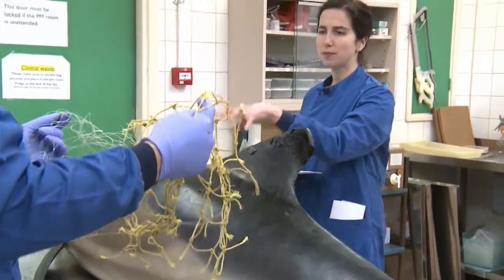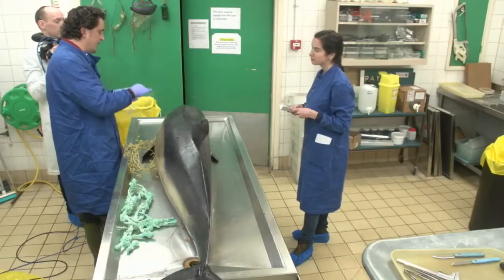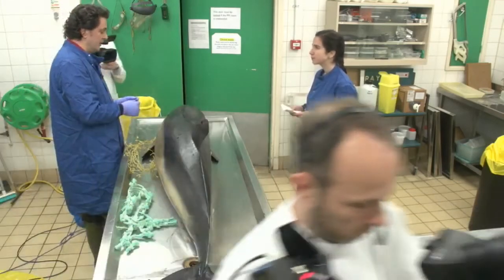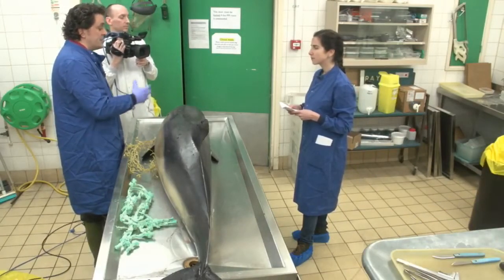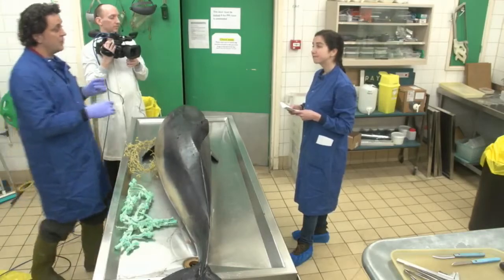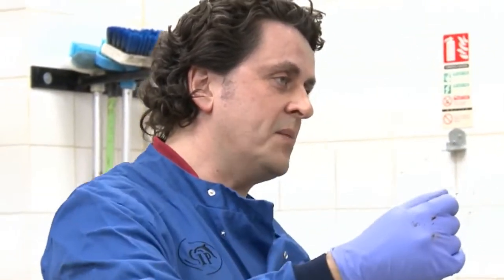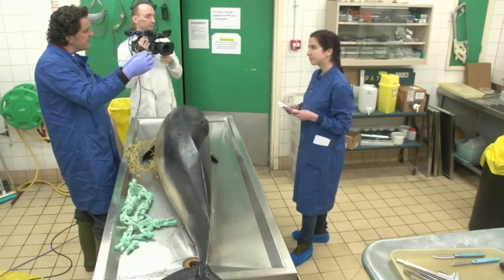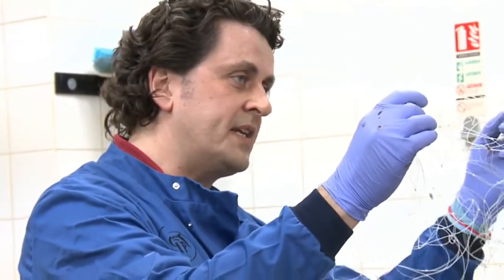So can we match up the marks on the animal then with the gear? Yeah, so that's what we're trying. Well, we can diagnose bycatch fairly readily. What we're really trying to get more involved in now is diagnosing the kind of fishery that's capturing these animals. So to generalize for a second, take a step back. Harbour porpoises, we think, are predominantly caught in monofilament type gear. So this is a tangle net. You might sink it on the seabed for a day to 2 weeks. It's a passive form of fishing, so you catch whatever swims into it. And that's why porpoises, which are feeding on the seabed, are potentially more at risk of being caught in this gear.